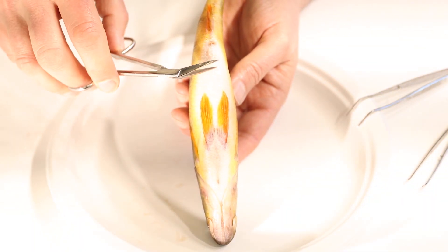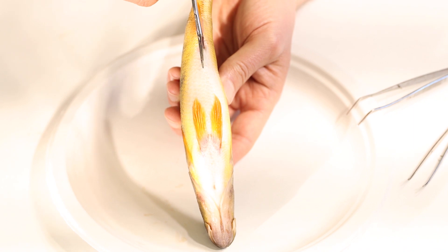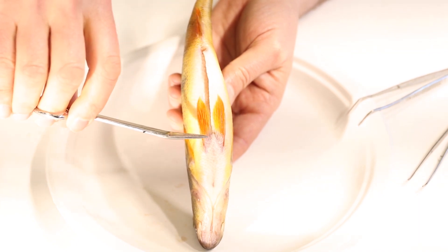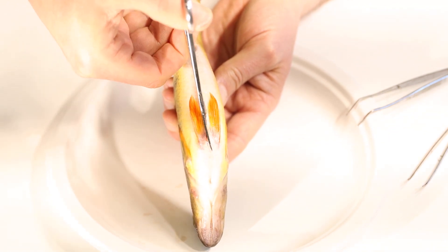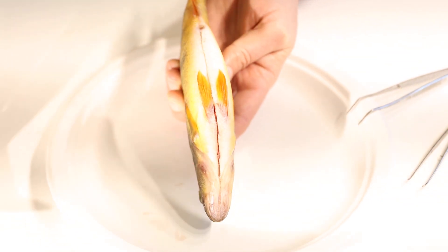When we open up the body cavity on our perch to find all the internal organs, we're going to start back here at the vent. We'll slide our scissors right into the vent and start cutting — right now we're just cutting through skin, so it's pretty easy. Once we get up to where the pelvic fins are, there's a layer of bone and it's going to get hard. We'll crunch through that bone and keep cutting all the way up between the gills.